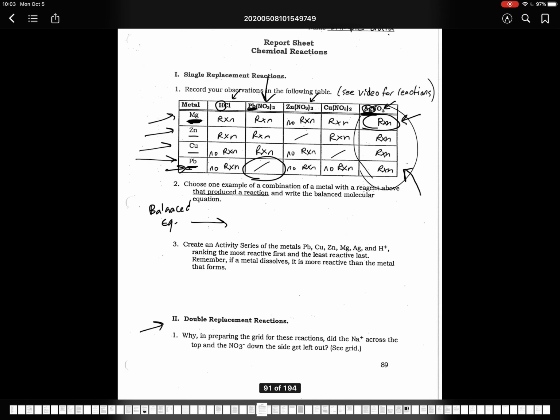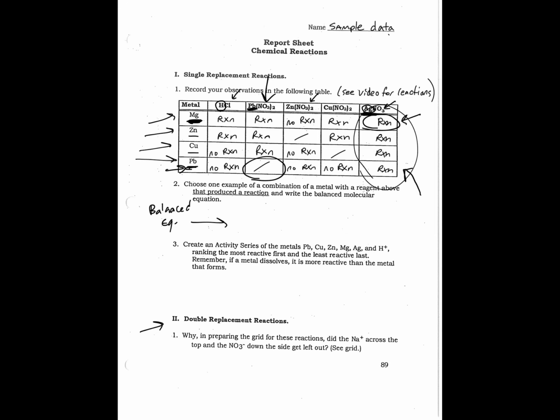And then the critical thinking questions refer to not just the first part, where they say, supposing a different metal like iron reacted with silver, where would you place it in the list of metals from most to least or least to most? So you can think about how iron, a metal that's not part of this experiment, would be ranked, again, in that critical thinking question.